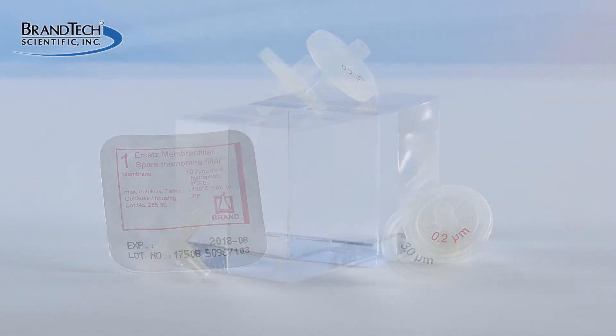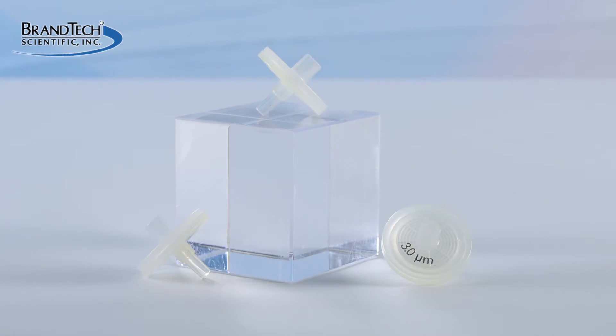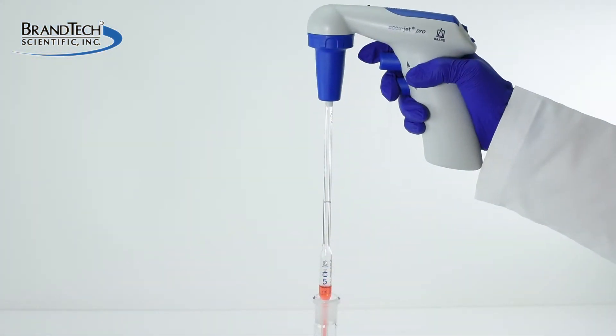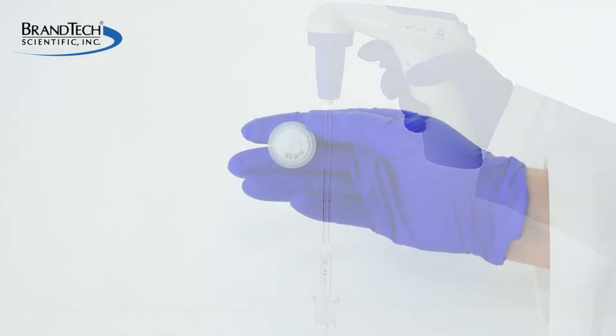If you are using an AccuJet to fill a Class A pipette, choose a 3 micron filter, which will allow for proper drain times.